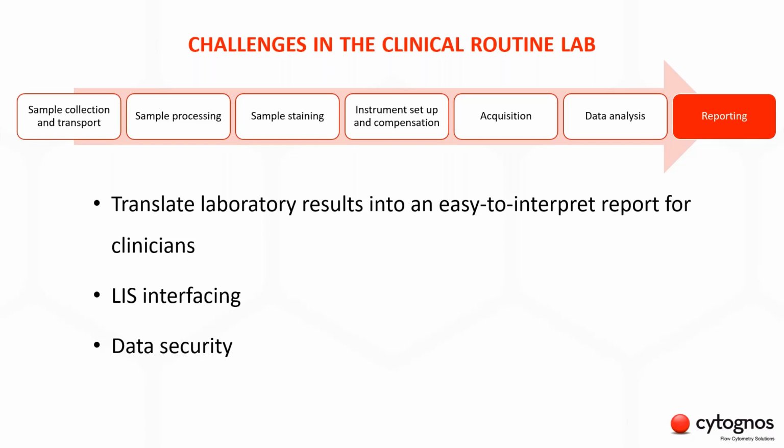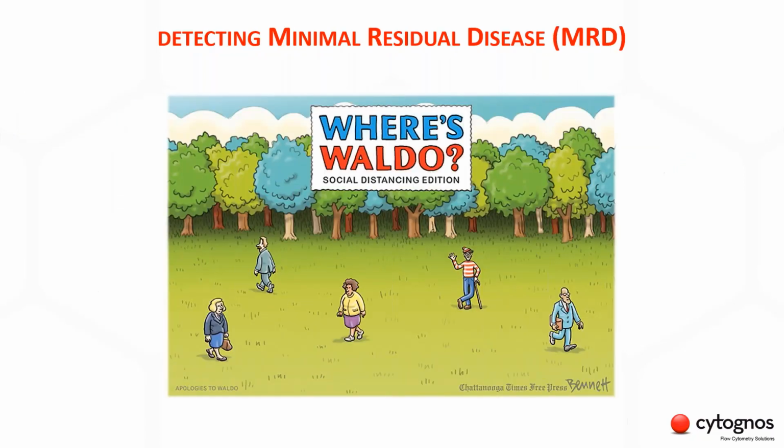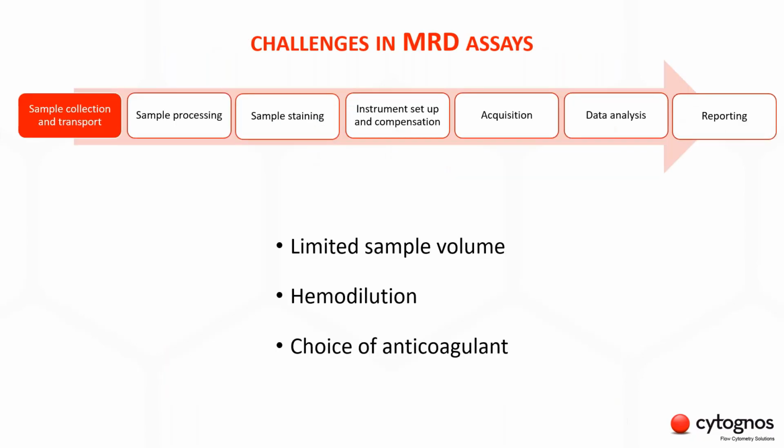So those are common points regardless of the type of study, but however, more sophisticated tests such as the minimal residual disease pose additional challenges in the lab. So now let's take a look over that.